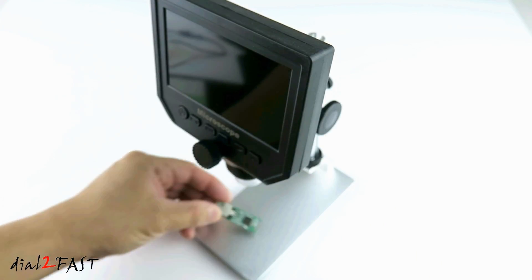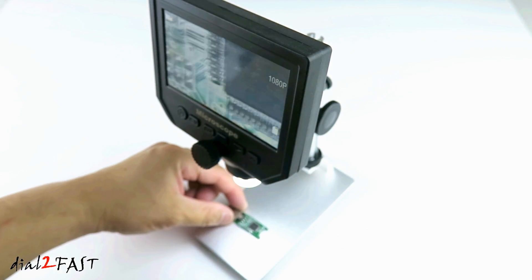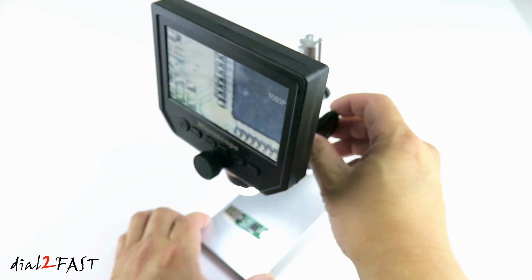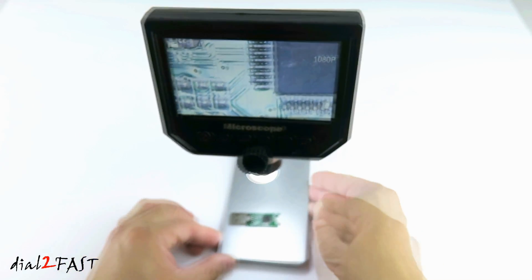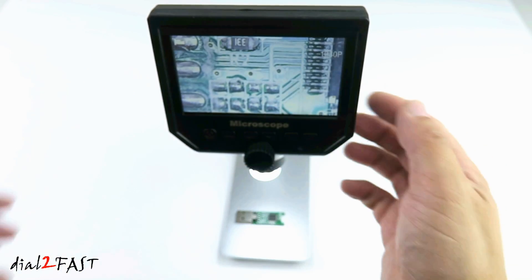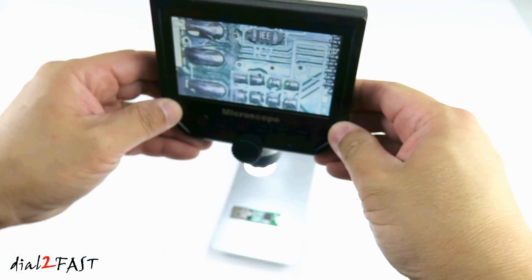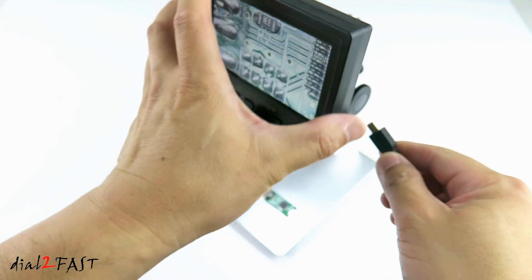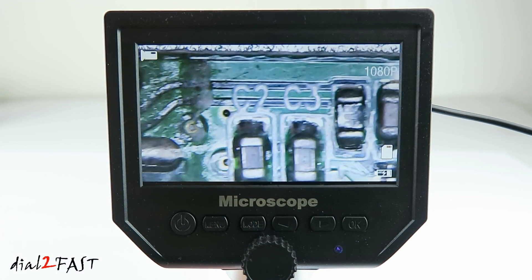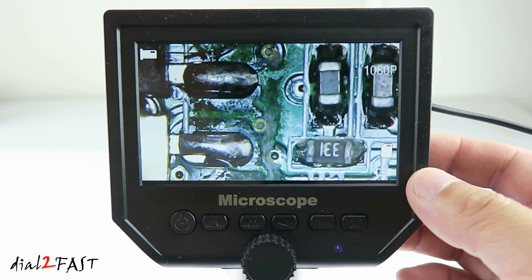Here I have a USB flash drive — I'll place it on the stand and turn on the unit. Use the dial at the back to adjust the magnification. The closer you are, the higher the magnification. Use the dial at the front to adjust the focusing. And then use the dial on the side to increase or decrease the brightness on the LED lights. Now if you find the contrast to be a little bit too bright, you can adjust the brightness of the LED.